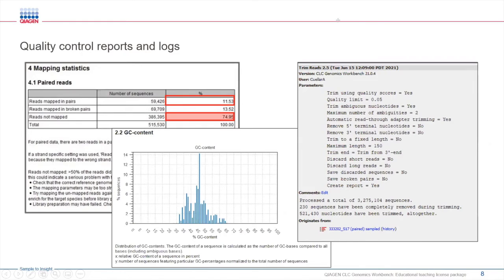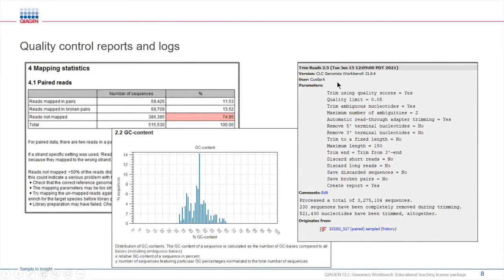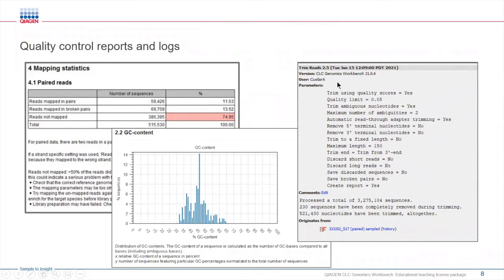In addition to generating QC reports, it's also going to generate a log that saves all the steps and settings you define when running the analysis, as well as what files that were used. It records the history of the analysis so you don't have to remember all the settings that were used.